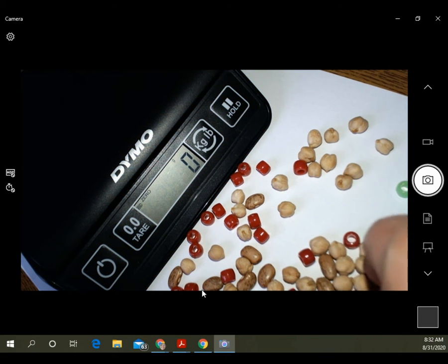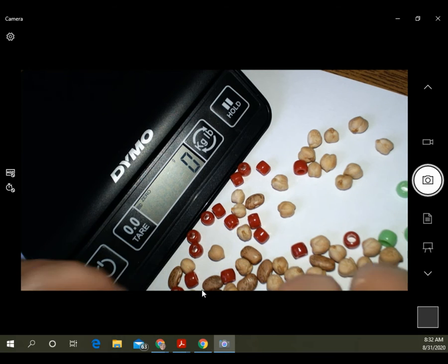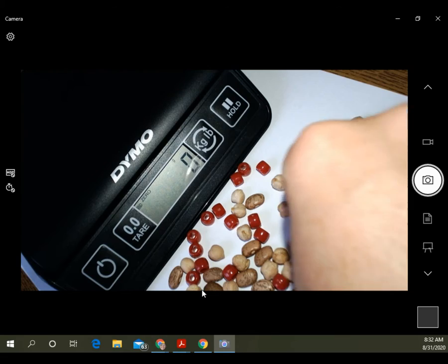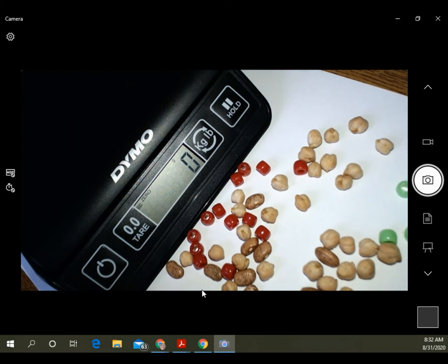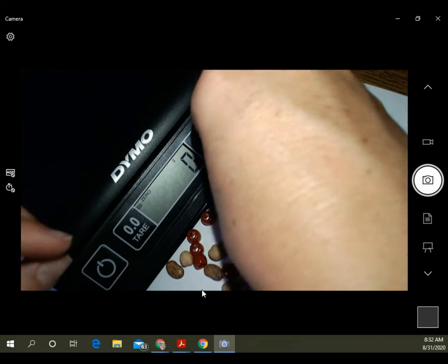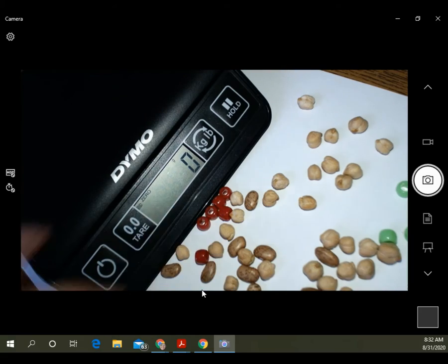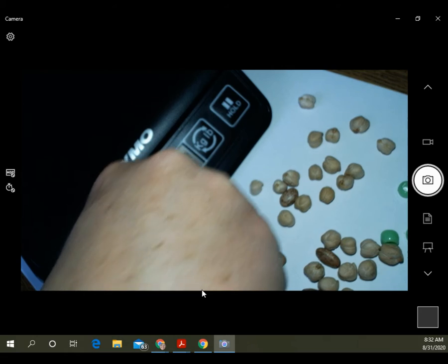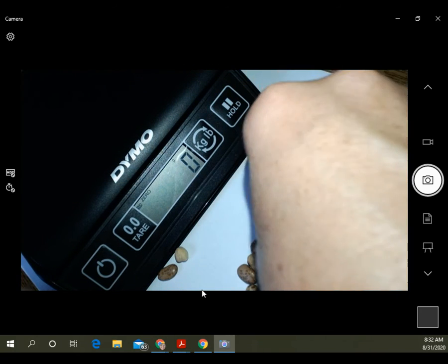And at this point, I'm wishing I had done just 3 things, but that's okay. This is probably the longest part of what you need to kind of consider, look at, think about. So as you can see, I'm just separating the mixture right now. I know this is super boring, but this is the way we have to do it.